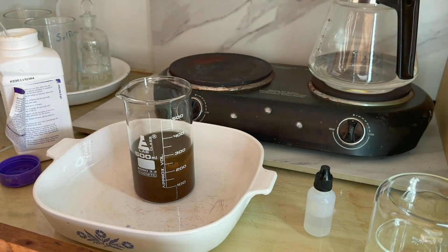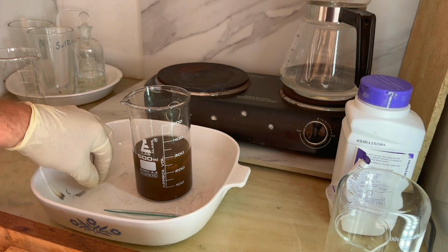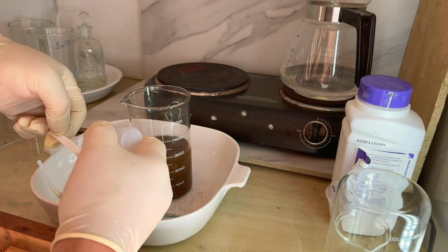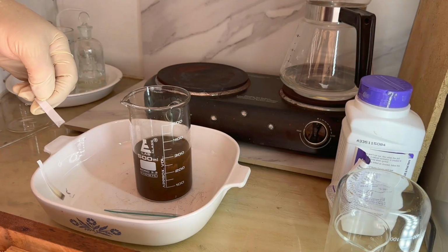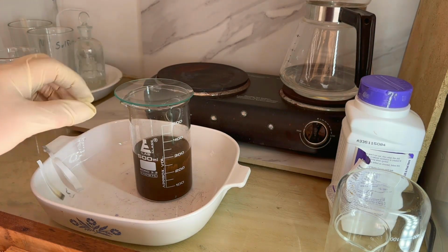We'll do a quick stannous test. Make sure we have all the gold out of solution. Our first test showed gold in solution. You can see it sitting there on the side. I've added a little more SMB. Do another test. Make sure we have it all this time. This time you can see it's negative. Absolutely nothing. So cover that back up.